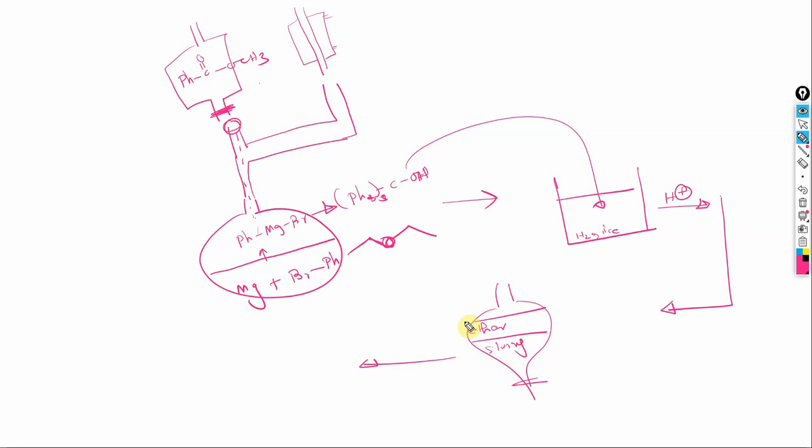And you'll be separating the ether layer, which is the top layer, right, into a beaker where you contain your compound, which is triphenyl methanol, and you'll be removing the solvent by evaporation to leave behind the compound that you wanted to synthesize. So when you remove your solvent by evaporation, you'll be left with the compound, which is your triphenyl methanol.